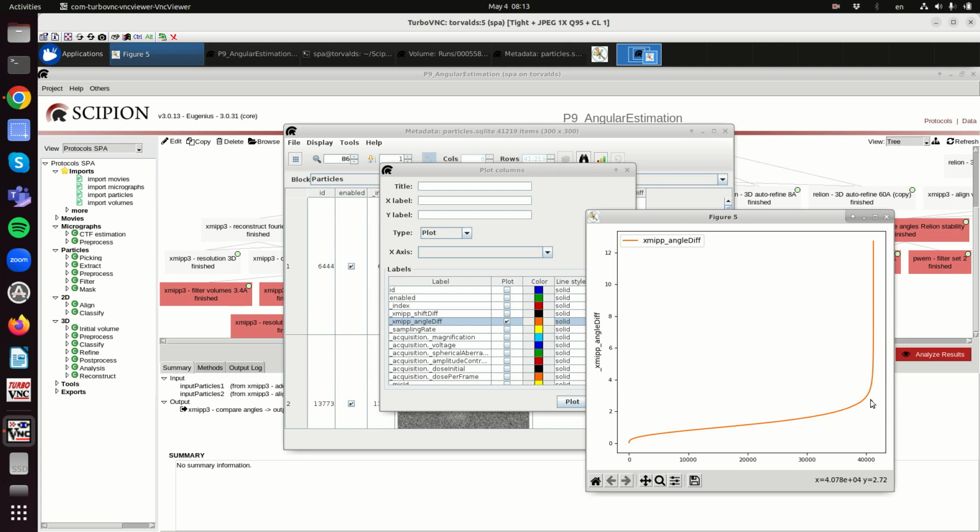Even if the average is zero, having an angular error around zero makes a blurring; it doesn't cancel out to produce the perfect structure. That is one thing. The other part of the message is that for a fraction of particles we will make big mistakes, even in perfect conditions.